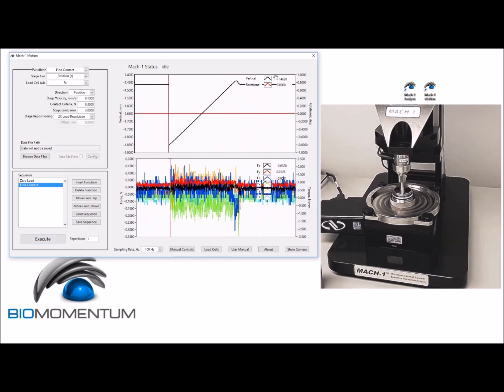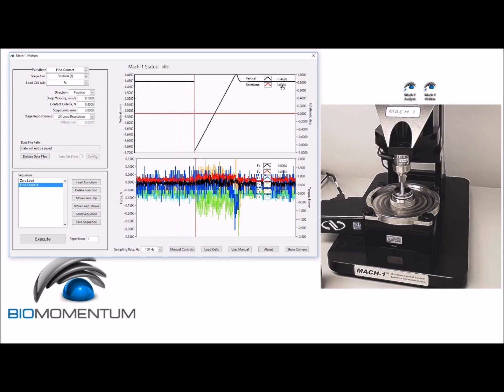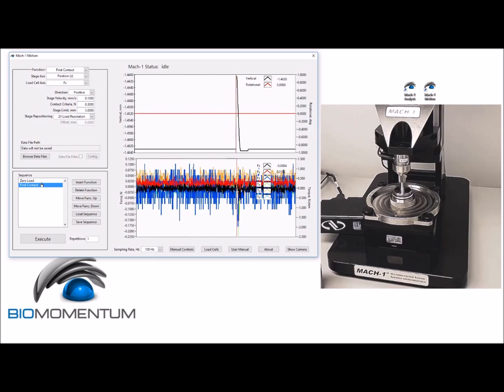Proceed with the following torsional shear sequence: a stress relaxation which corresponds to a pre-compression of the sample.